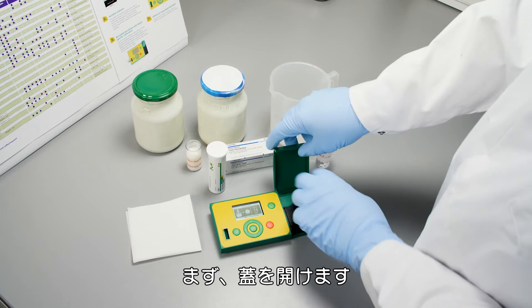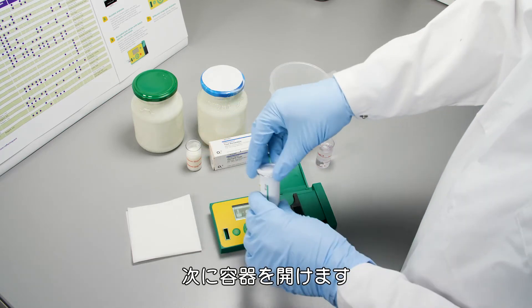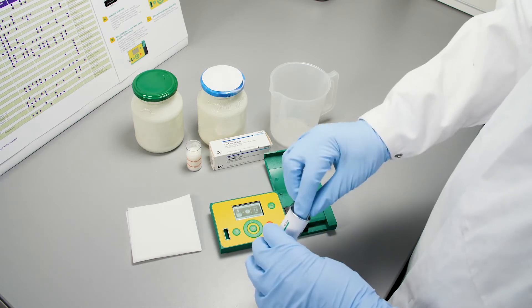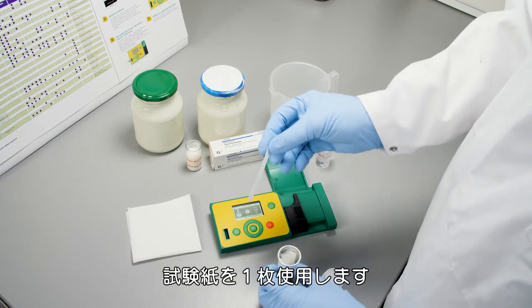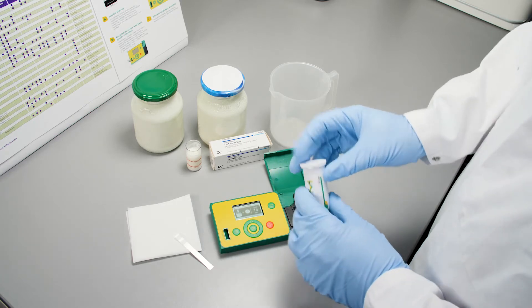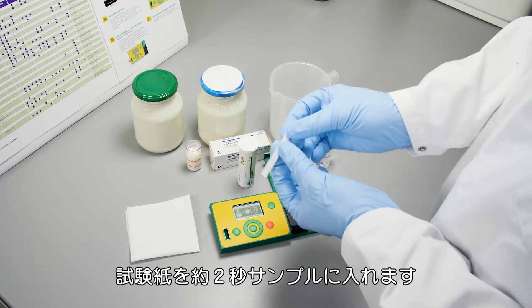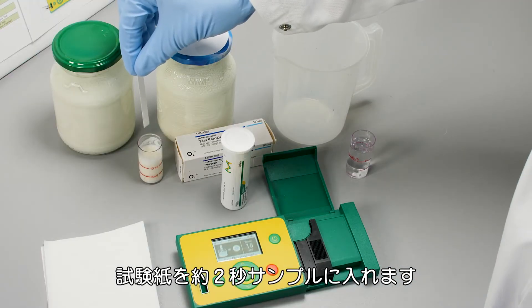Before we start, we open the lid. Then we open the box and take one test strip. Close the box. Then we stick the test strip into the sample.